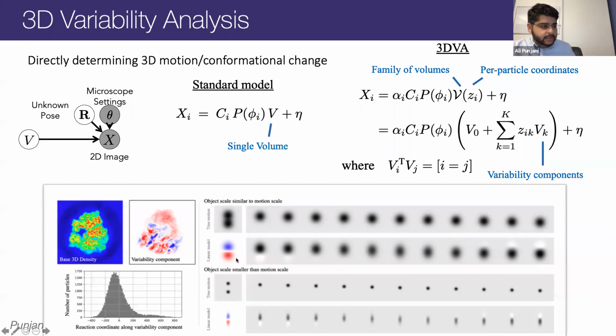So in this case, we're seeing a motion that is about the same size as the size of the object or the resolution of the object. I mean, this dot maybe has lots of little tiny details, but maybe we just haven't seen it at that resolution yet. So this is a fundamental notion. We can resolve motion of objects at a length scale similar to the resolution and size of the object.